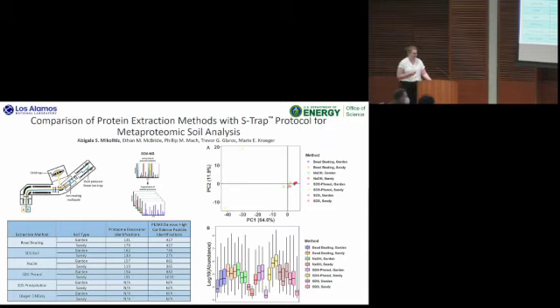We have questions. I'll ask a question. So you mentioned that you've used a FAIMS device to do your analysis. Judging by your numbers, it doesn't seem like your mixture is very complex. Did you try doing the same analysis with no FAIMS and see how much FAIMS helped you?